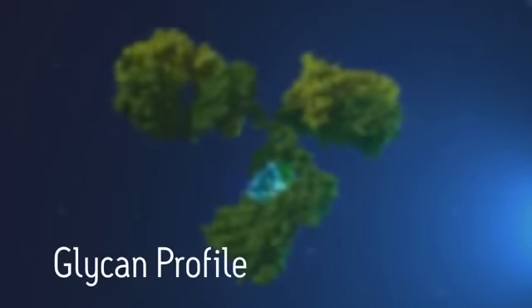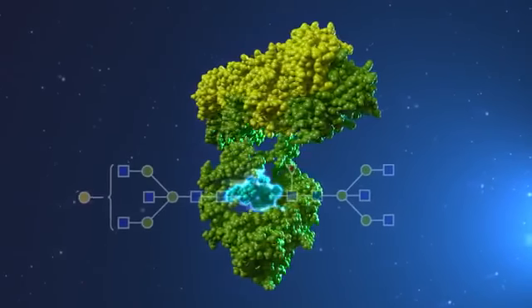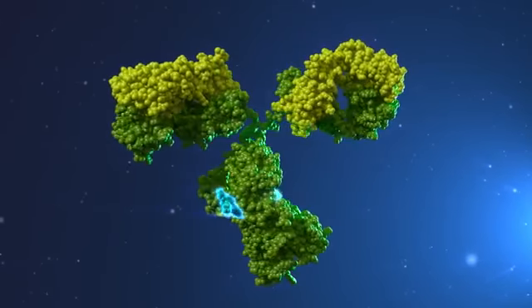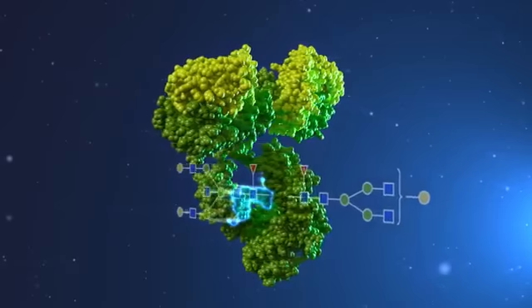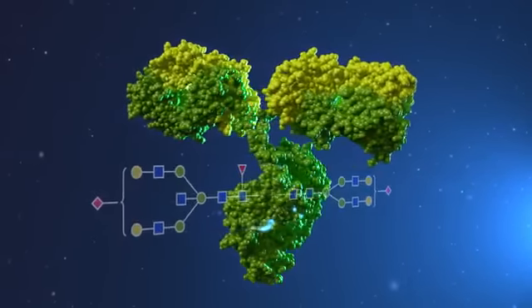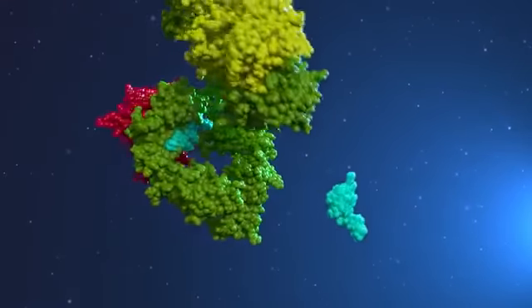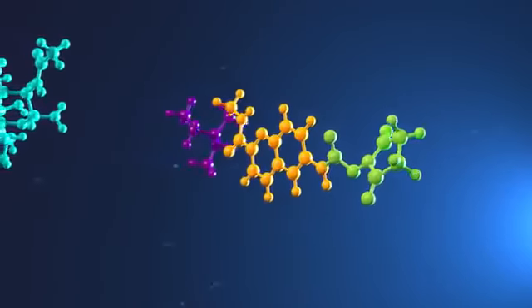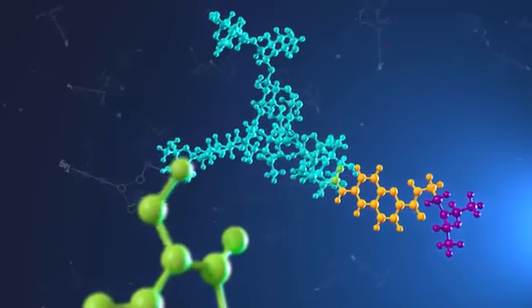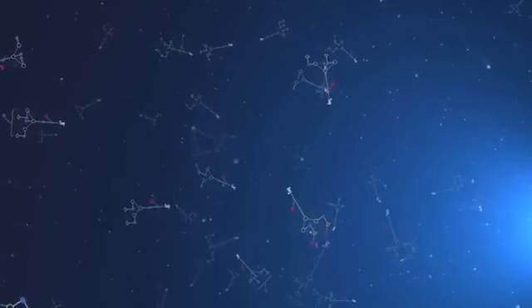One of the most challenging aspects of creating a biosimilar is optimizing a production process that yields a glycan profile consistent with that of an innovator molecule. While intact mass analysis can provide an overall glycan profile, assessment of critical minor glycoforms requires more detailed analysis. N-glycans can be released by digestion with the enzyme PNGase F and labeled with a reagent such as RapiFluor-MS. UPLC fluorescence MS of the labeled glycans gives a more accurate picture of the major and minor glycans present.